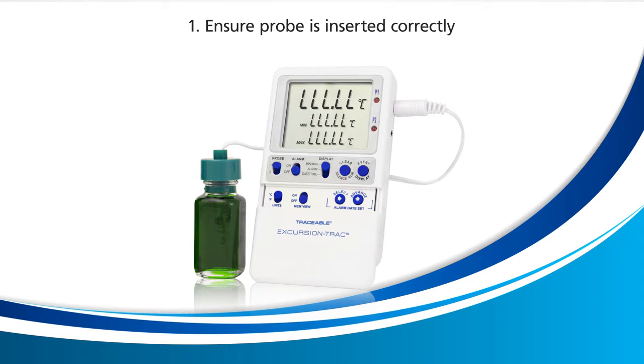If the LLL.LL error goes away and temperature numbers begin to appear on your device, the problem has been fixed. If LLL.LL remains, let's move on to the second remedy.